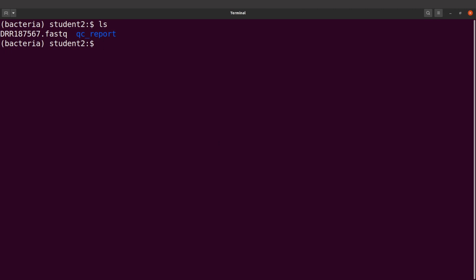All right, so we will call filtlong now. I'll say filtlong, then dash dash min_length, and I'll say 1000, and then I'll specify the raw file, and we are going to output this to a file.